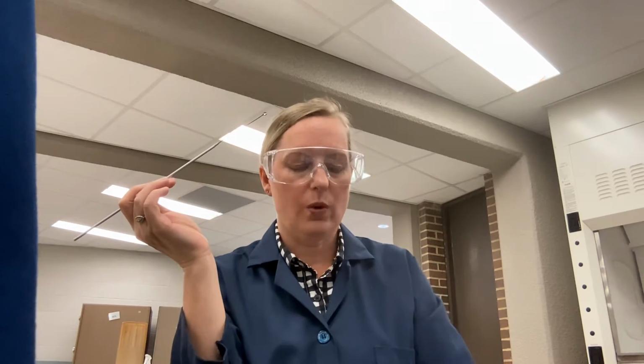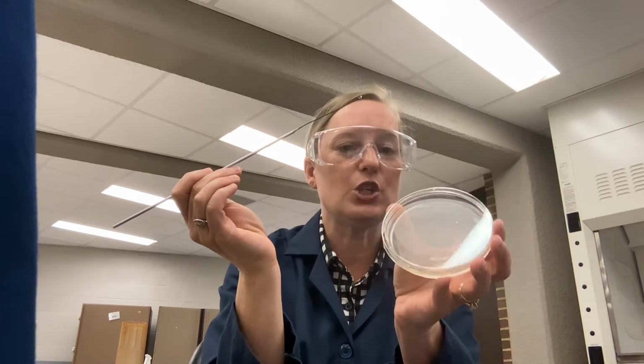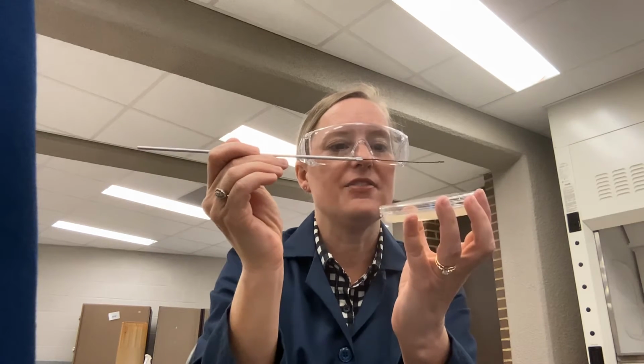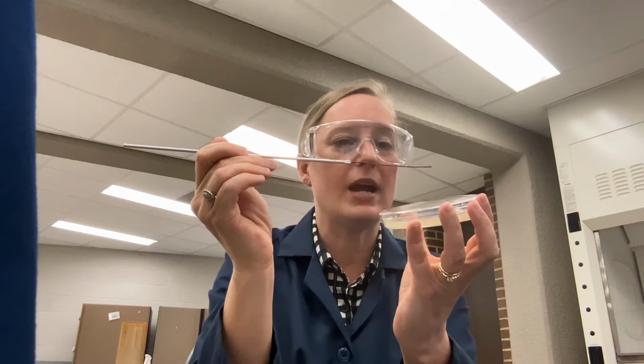I'm going to put the flame off to the side a little bit so you can see what I'm doing. So I'm going to then add this 1 loop of bacteria to the plate in what I'm going to call zone or quadrant 1. You're going to have the loop flat with the plate, meaning you want to not make huge dragging marks.